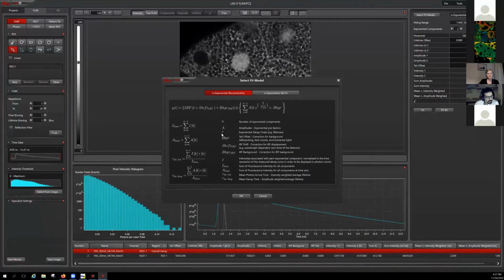How do you mean with short lifetime? Any range? Okay. I don't mean that's why short lifetime. So in our case, we are talking about a few hundred picoseconds. I'm not sure if also that's 1 nanosecond. I have not really measured with a dye with around 1 nanosecond lifetime. That would just affect as well.